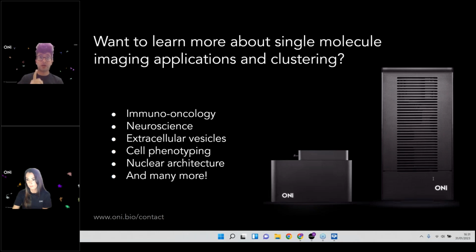I should note one thing is possible already, which is that if you have two different channels, let's say you've labeled two different objects of interest, you can cluster those channels either as a group or separately. That means that, let's say I have a cell with two different objects inside which are labeled differently, I can cluster those two objects independently, and then I'll get different metrics for each group of clusters to get whatever analysis I'm looking for exported.